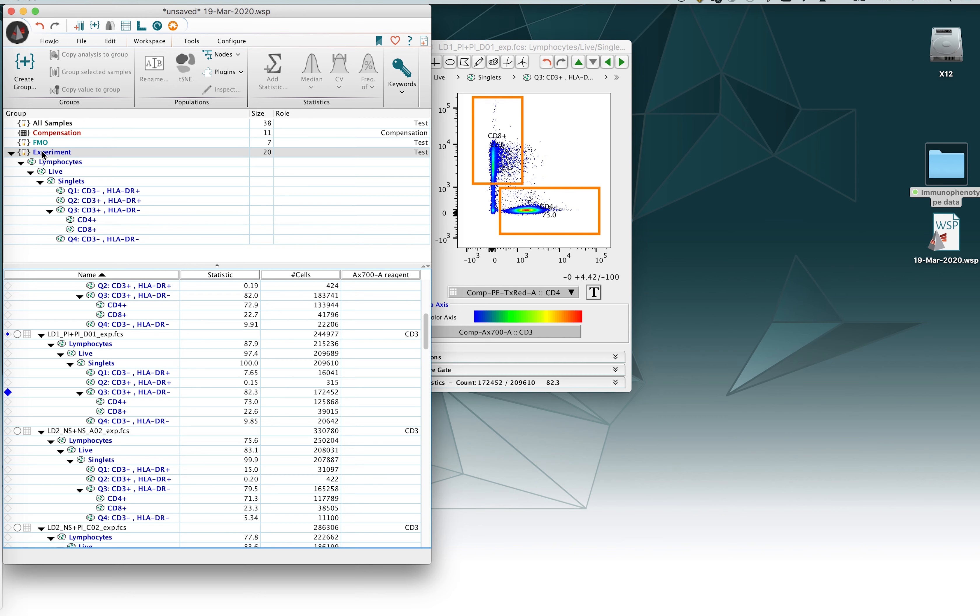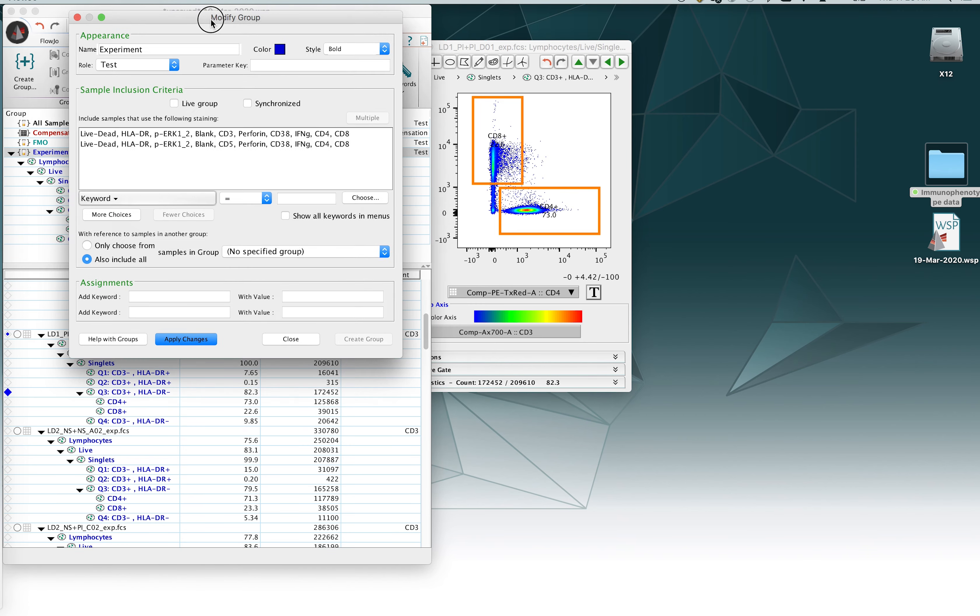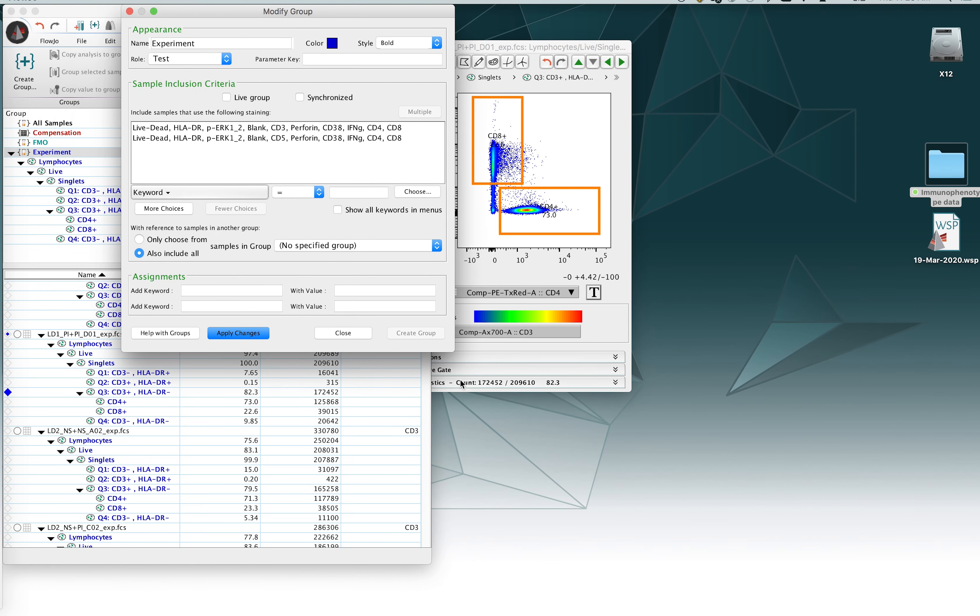You can synchronize the gates by double clicking on the group you're working in. This will only work in groups that are not the all samples group. So you may need to create a group first in order to be able to perform this function. Go ahead and double click on the group. This will bring you to the modify group menu. In this particular menu, you'll notice at the top here there's an option for live group as well as synchronized. Tick the synchronized option and then say apply changes.